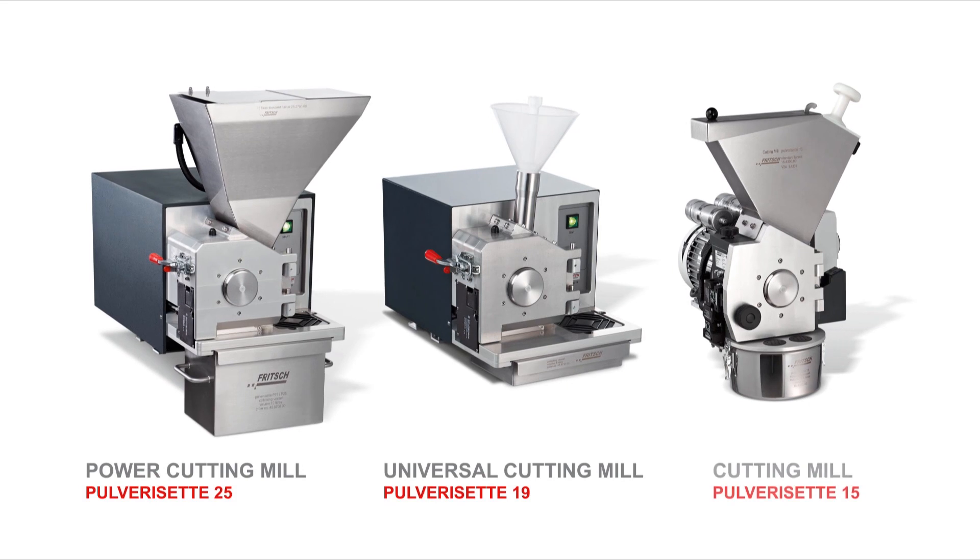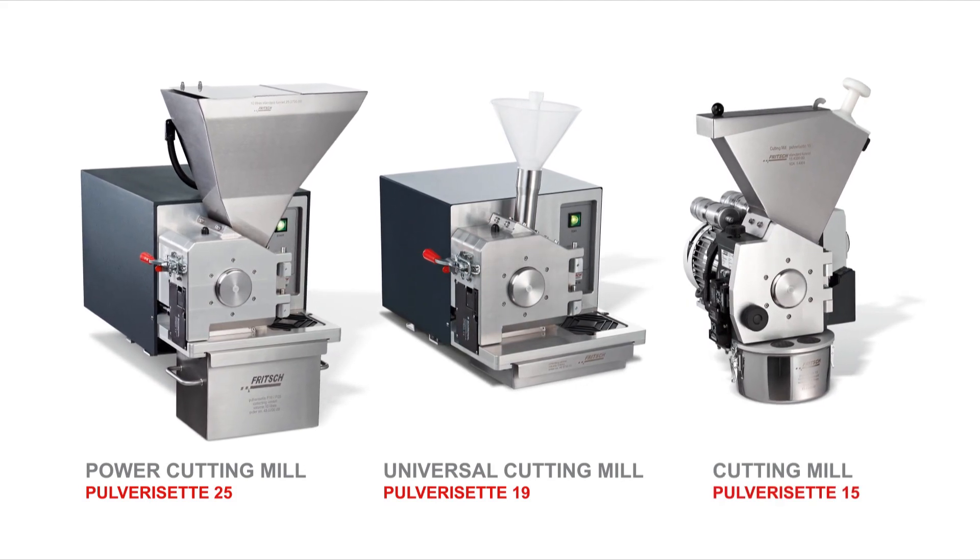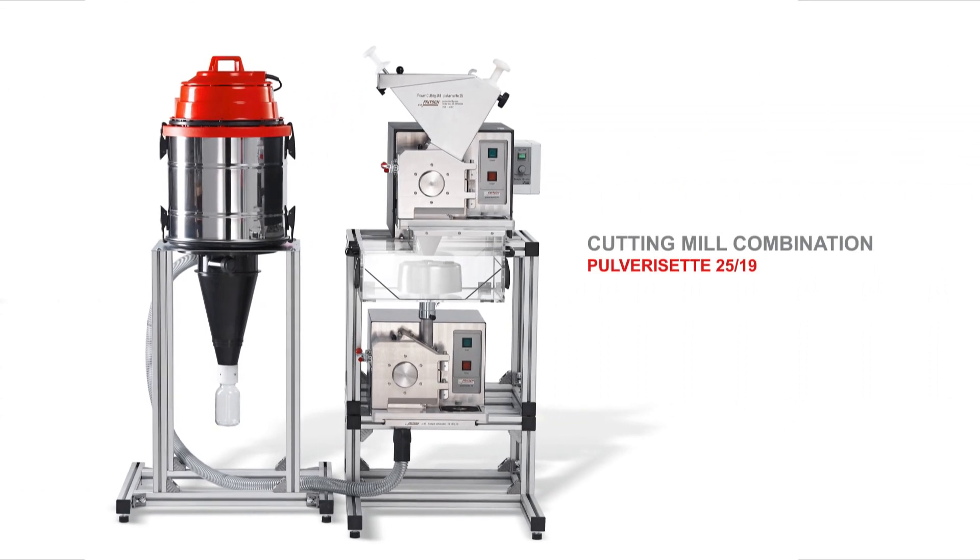Fritsch cutting mills are the ideal solution for your application. Fast. Safe. Simple.